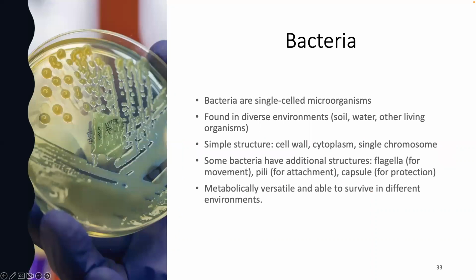So we're going to focus on bacteria for this approach, because the case study that we're going to reference is going to be looking into a bacteria, but it's important to note that resequencing or whole genome sequencing can be applicable to all organisms, of course, with the caveat that there is a reference genome. We will be touching on later what you would do without a reference genome. That's known as de novo sequencing. But for now, we'll talk about resequencing, the availability of a reference genome. We can take a look at what is present in our organisms versus what's known.